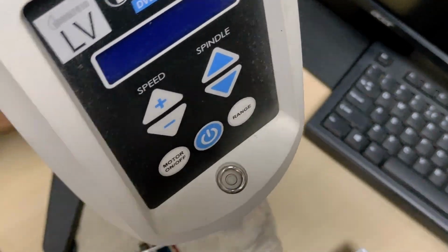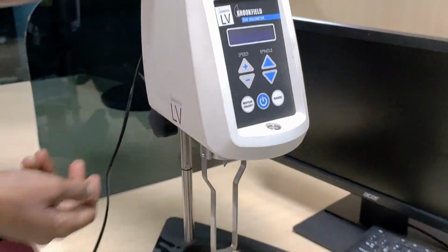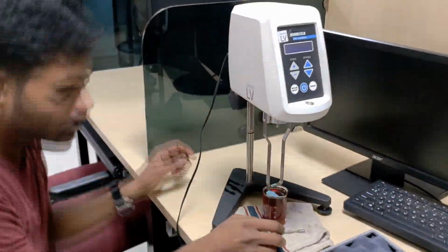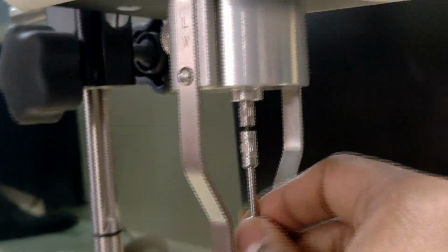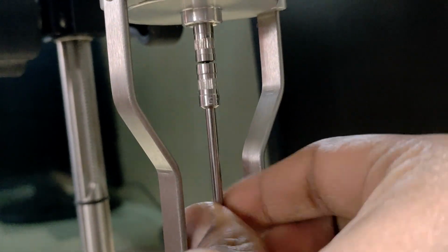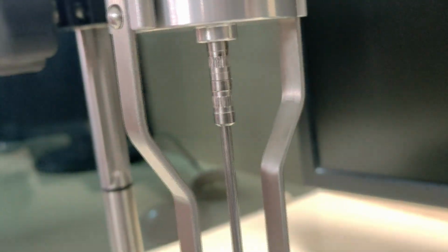And when you tighten it, we then need to use the other screw to bring it down. Before that, we need to connect the spindle, like that.